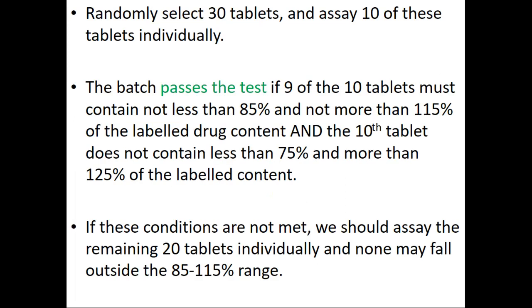Procedure: randomly select 30 tablets and assay 10 of these tablets individually.